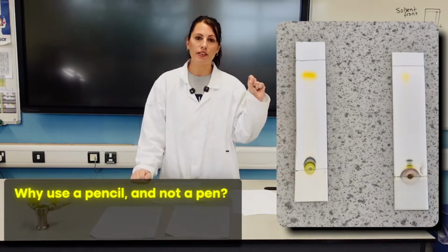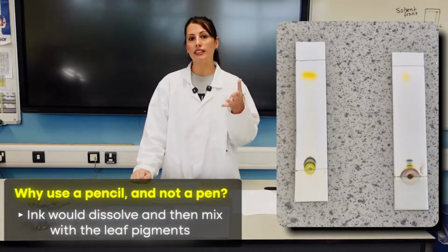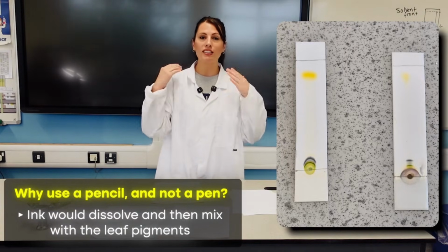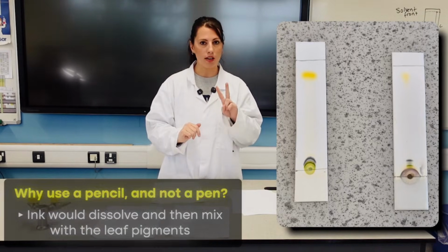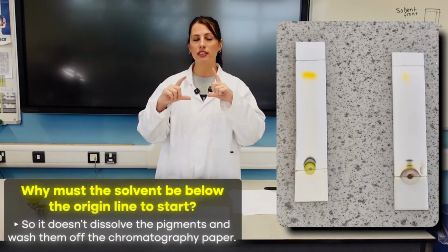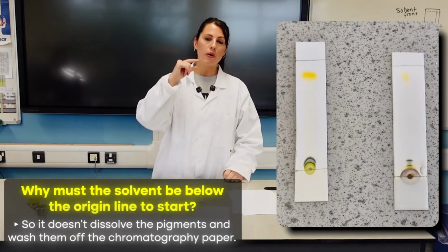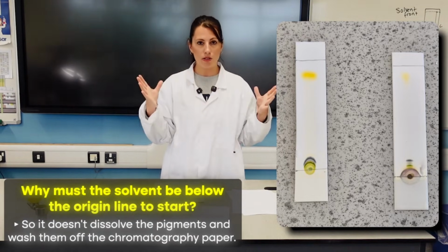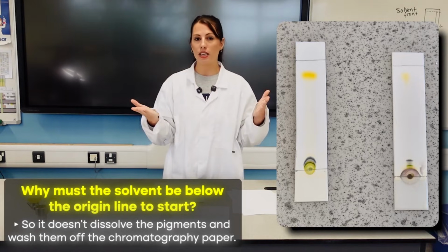They should always be drawing in pencil, because if they use ink, the ink is going to be soluble and that will move up as well with the pigments, and that is a common exam question for 2 marks. They should also make sure that when they place their TLC paper in the solvent, that the solvent lies below where the pigment is. Otherwise it could splash onto it, dissolve the pigment, and then you lose your pigment spots. Again, that's a common exam question.